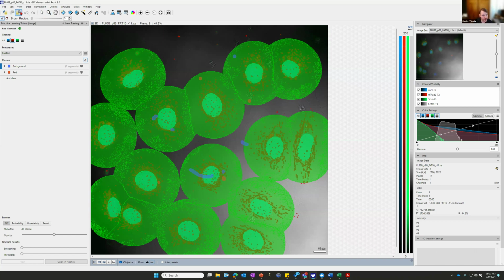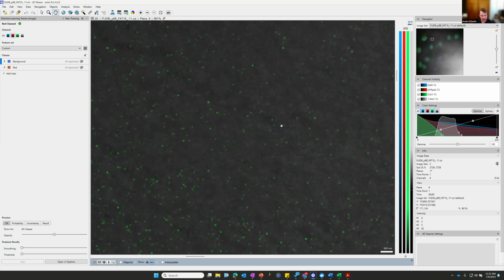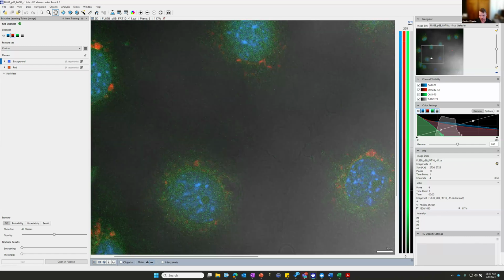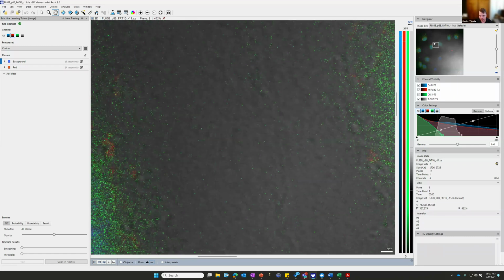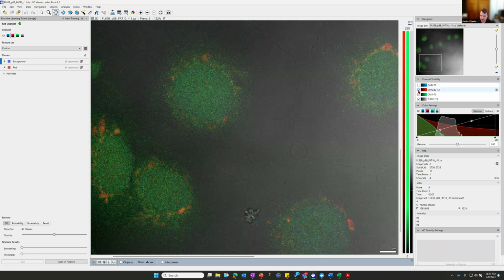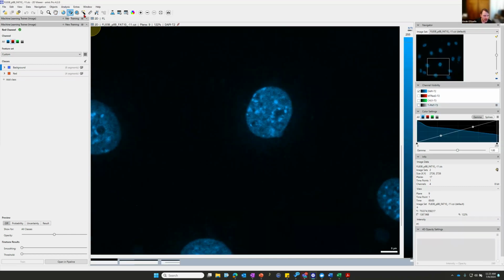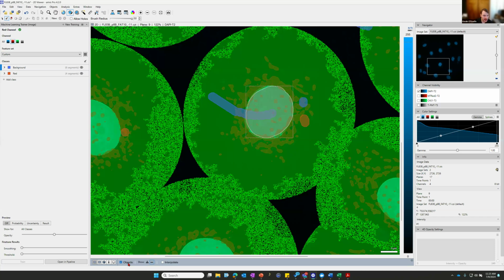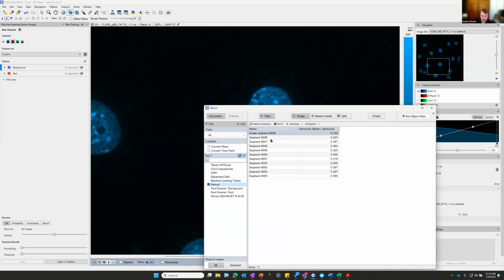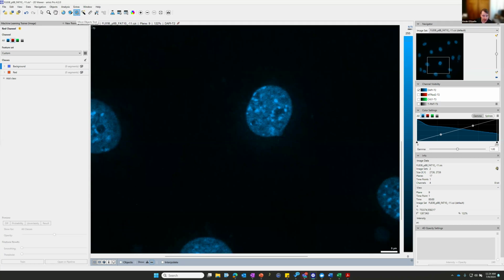These are your open, save, and close buttons, your pointer, your zoom tool, pan tool, grip, move. You can also take this and move it on the window. We're in this viewer right here. I mentioned it before, but we have this manual draw objects. So I want to draw this. Have that there. Get rid of that because you don't care. You can also move those objects too.